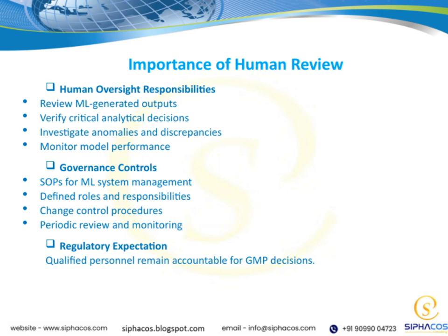Moving on to governance controls, having clear standard operating procedures, or SOPs, for managing ML systems creates a structured approach. Defined roles and responsibilities ensure accountability, so everyone knows their part in maintaining system integrity. Change control procedures are vital. They help us manage updates or modifications systematically, reducing risks. Lastly, periodic reviews and monitoring help us stay on top of system performance and compliance over time.